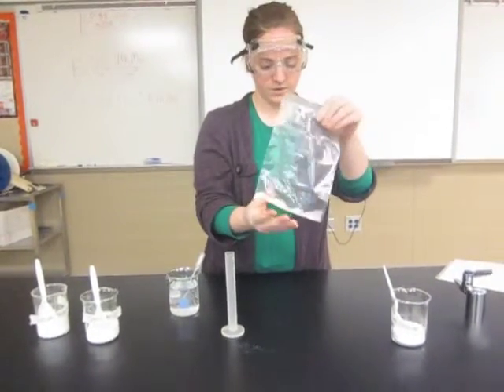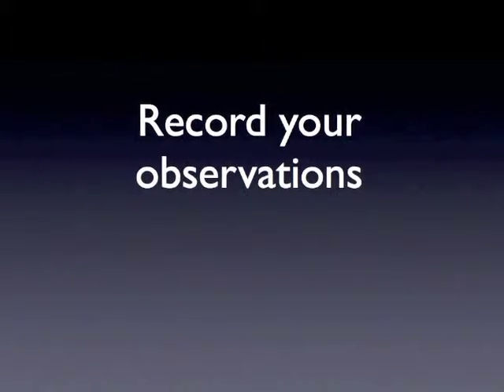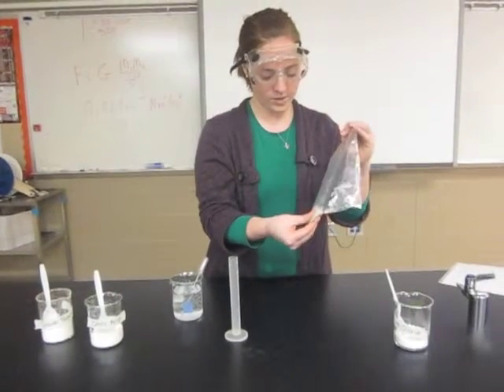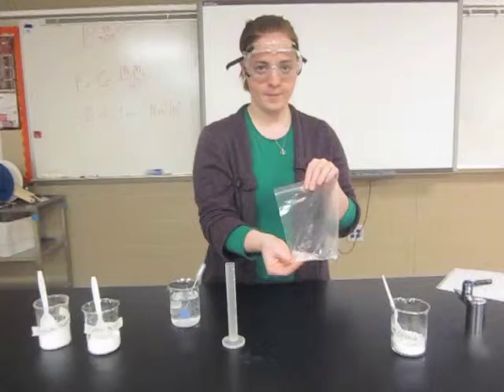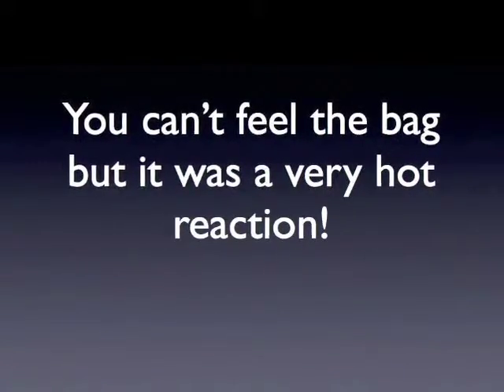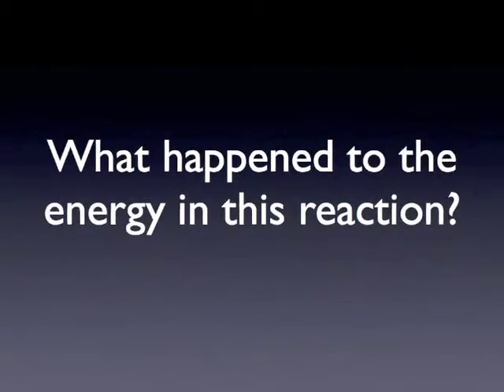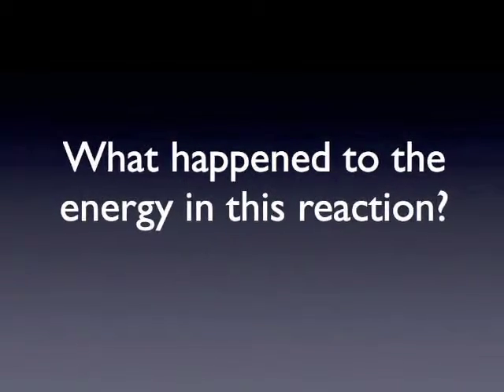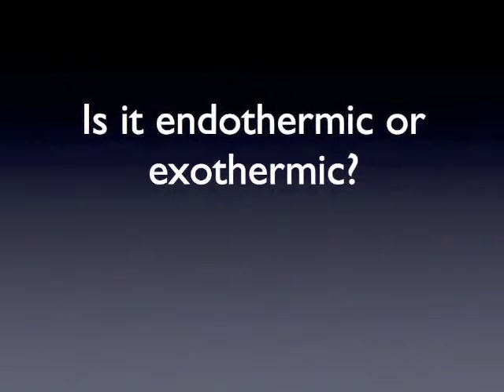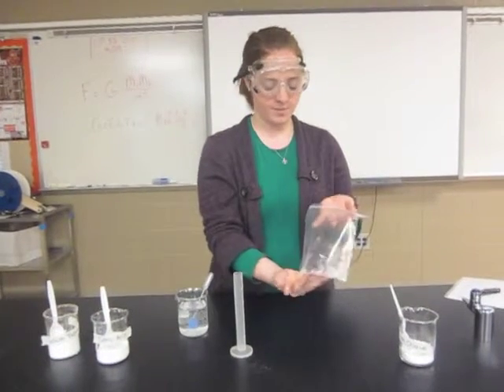All right. Mix it around and record your observations. Give everybody the opportunity to feel it. What does it feel like? It should start to warm up or get hot. What do you see? What's happening to the energy? Is this an endothermic or an exothermic reaction? Record your results on your paper.